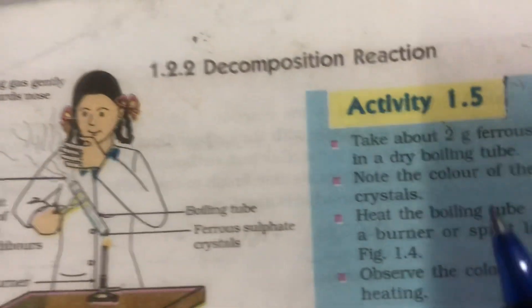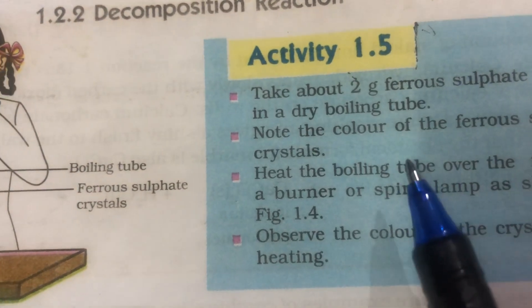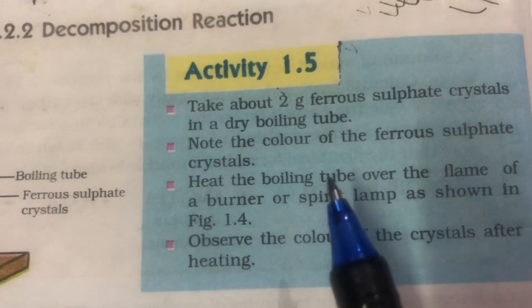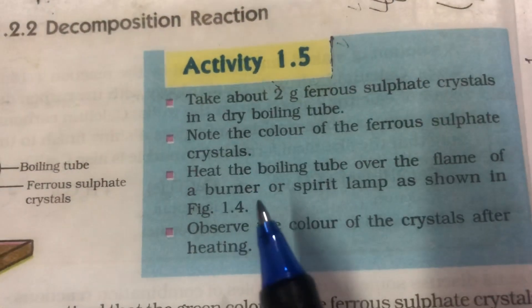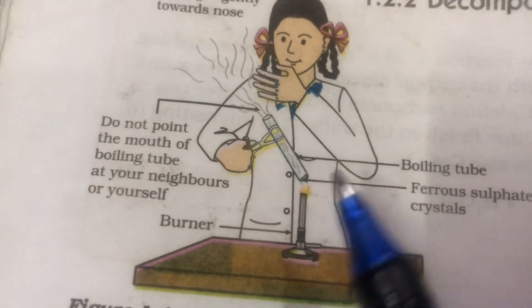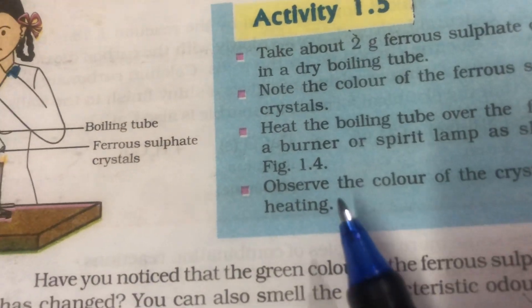Remember this. Coming to the procedure again — note the colour of the ferrous sulphate crystals. All of you will answer here that the crystals are green. You have to write these answers in the book which you have. Heat the boiling tube over the flame of the burner or spirit lamp as shown. Please observe the heating carefully, and then observe the colour of the crystals after heating. You will have to write down the observations.